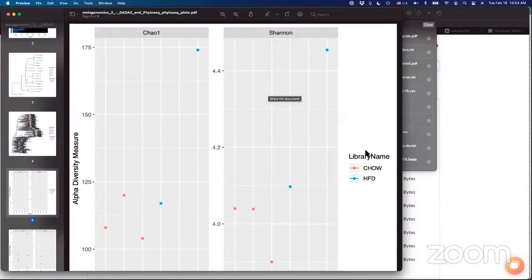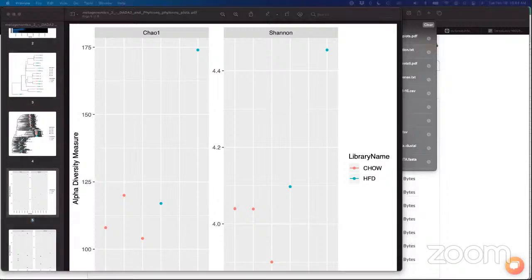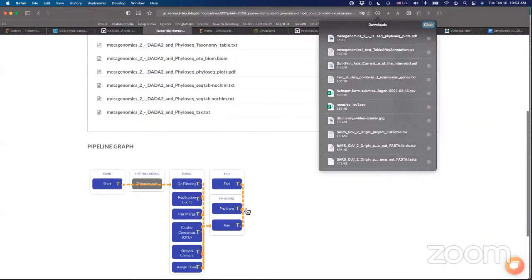Okay, so in this example, we're using a particular data set. So to give you an idea of some of these data sets, I want to introduce a few different applications of the microbiome that we will use in this program. But before I do that, I also want to mention that we will use some of the methods that we've seen here, including phyloseq and the different methods that are packaged within this package, as a way to learn a little bit more about coding.